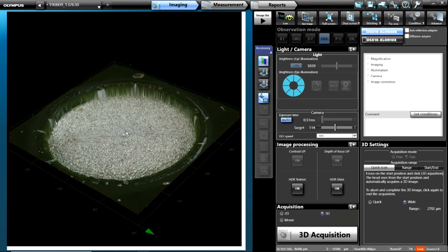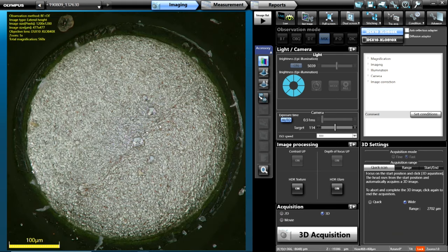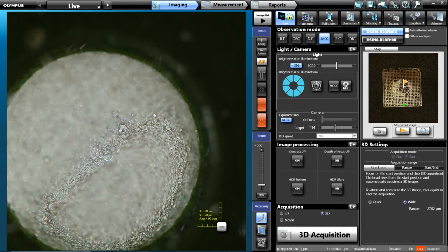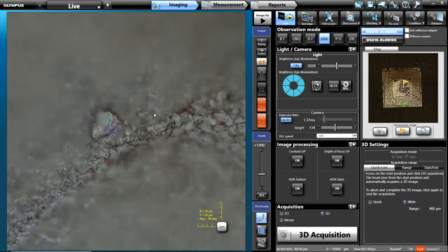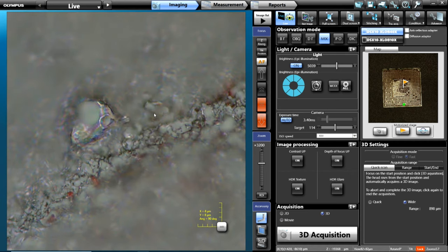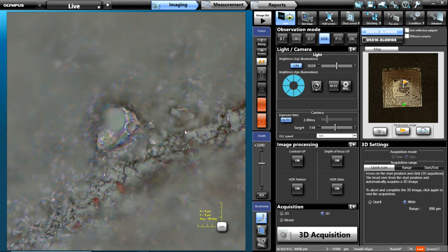We might want to do a volume measurement on something like this. If there's a small spec on here, you can go back to live, center up on it, focus on it, and optically zoom in — gaining that magnification range. Here we're at almost 3,000 times magnification, and there's 3,200. And you're not getting pixelation in the image — this is optical zoom. This is a long working distance objective with very high resolution capabilities, which is something specific to the DSX-1000. We don't have any other microscopes using this objective with this amount of working distance at that higher resolution. It's really unique.